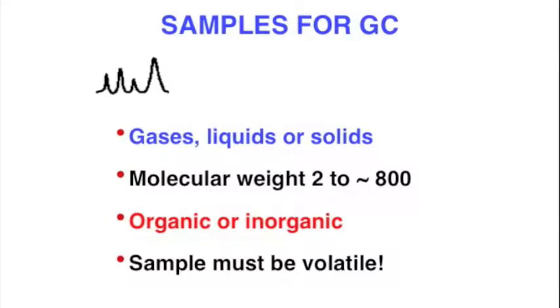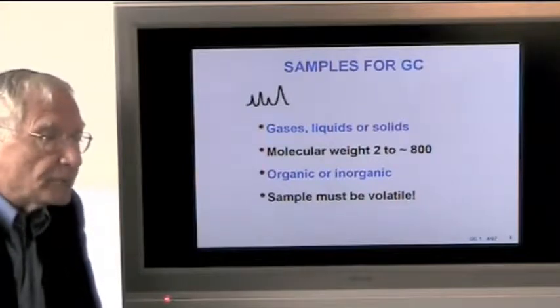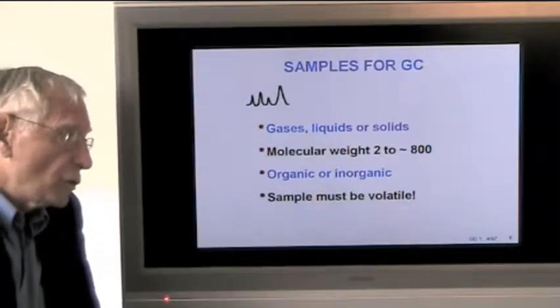The sample, however, always must be volatile. I like to say you cannot do rocks or sticks or stones. You can also not do proteins, peptides, biological molecules. Those are better done by liquid chromatography.